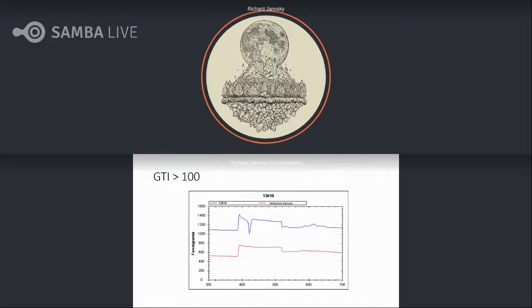So next, we're going to see an example of a grease that has started to harden. Here we can see the blue line is much higher, and it has required more grams of force, almost twice as much, to extrude that grease. So we know that this grease is going to require more force and be harder on the machine when the grease is running.